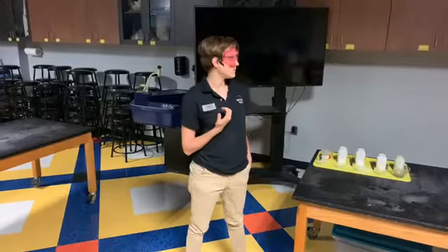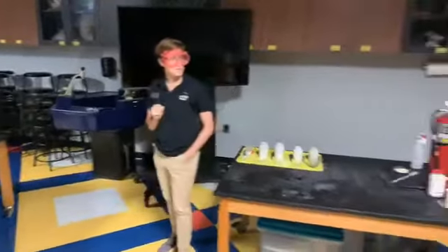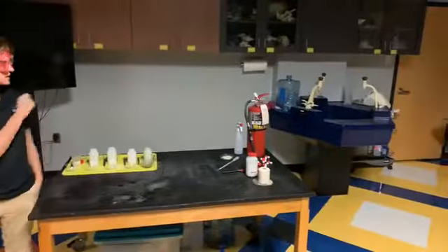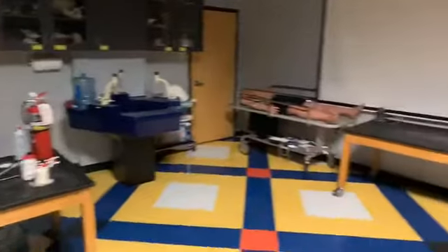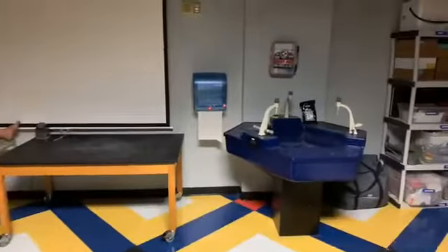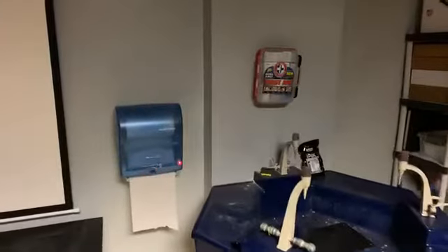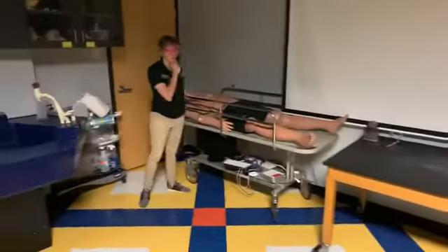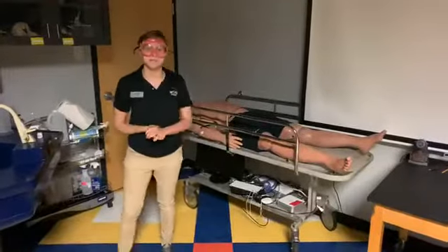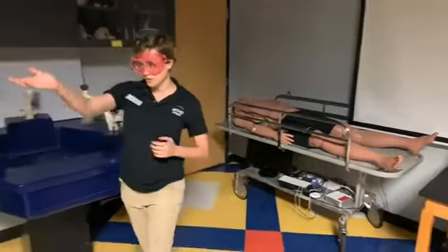And we have a lot of equipment here to help us do that. So we have, for instance, not only our excellent chemistry sinks with different gas hookups, we have, of course, our safety first aid kits, and kind of do a search and find, see what you can see around the lab. We've got all kinds of things like rockets, and we've got Mediman over here that we use for our first aid training and different health kind of exhibits and lessons that we do. We have, of course, our fume hood as well.